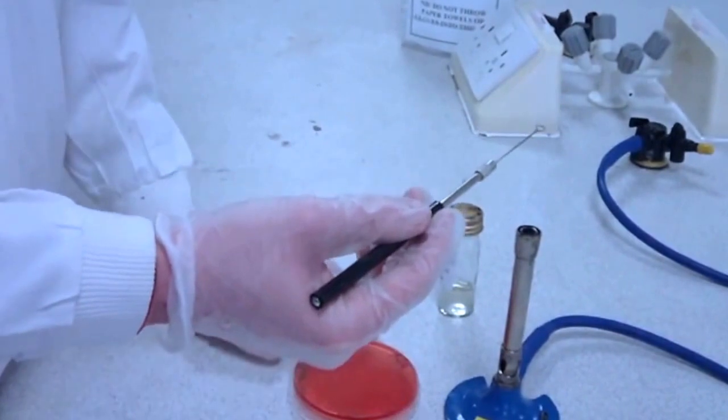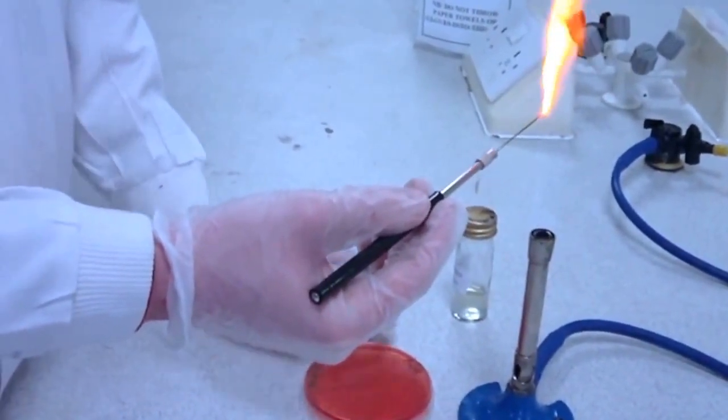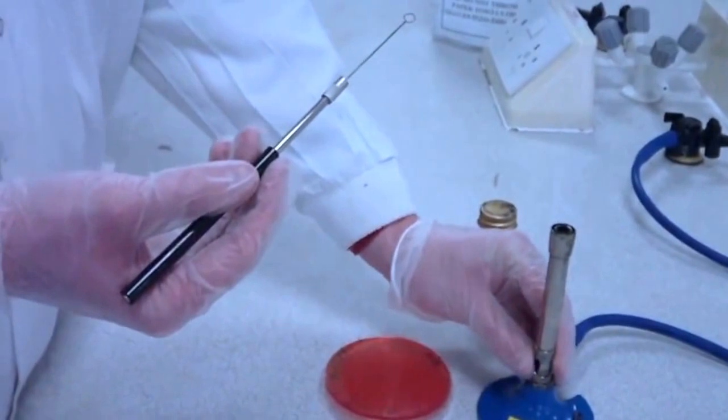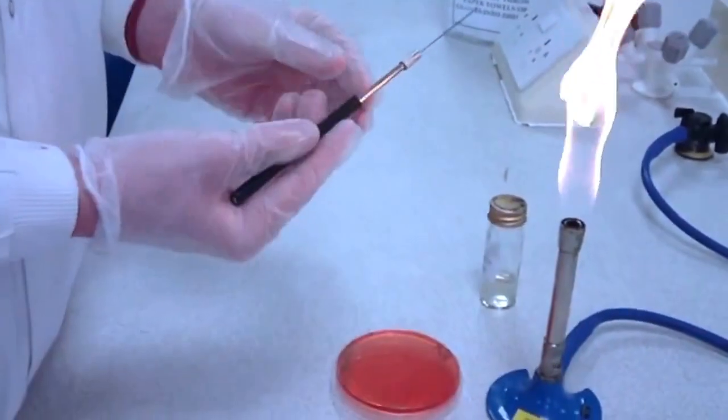Reflame the loop to sterilize before putting away. Turn the Bunsen burner flame back to safety and leave the agar plates on the side to be collected.